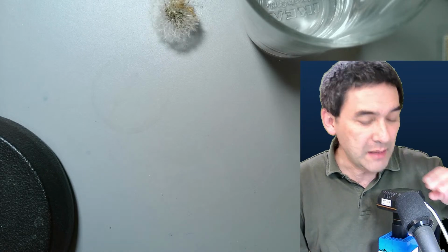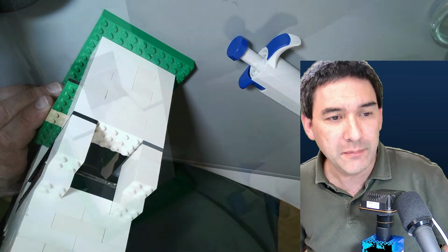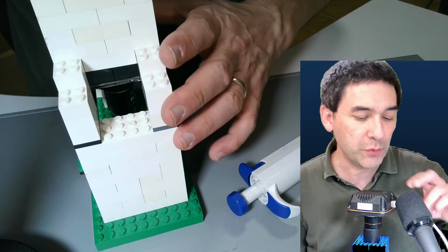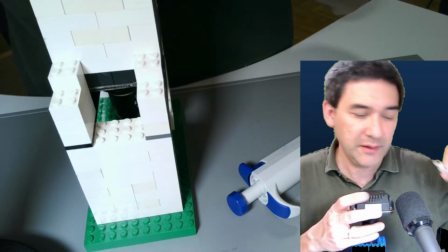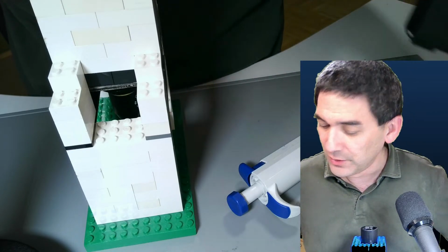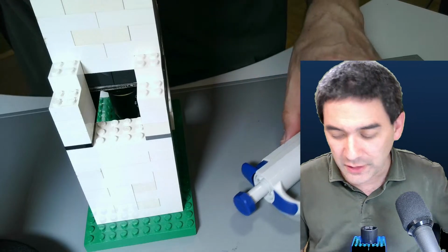What I'm going to do now is flip around the image, and I'm going to show you the Lego microscope in a little more detail. I'm going to unplug the thing now. The purpose is to give you a demonstration here.